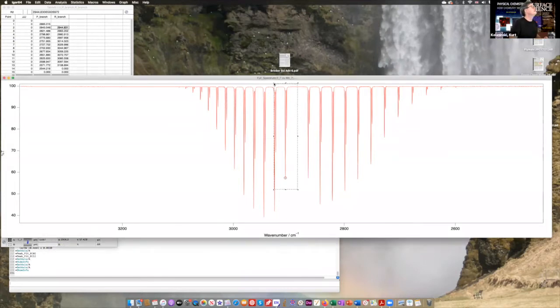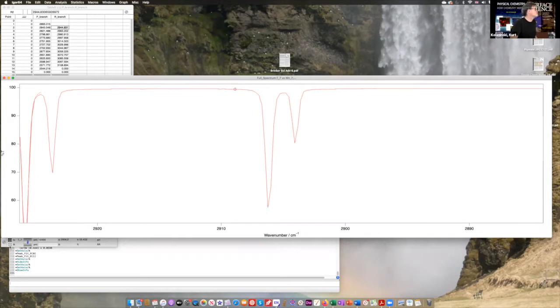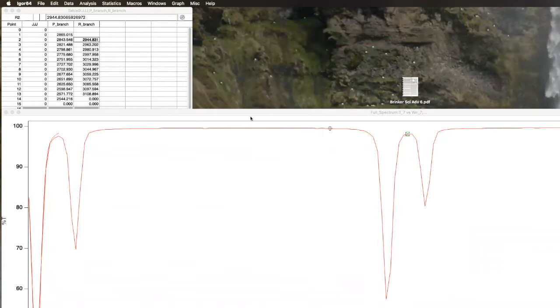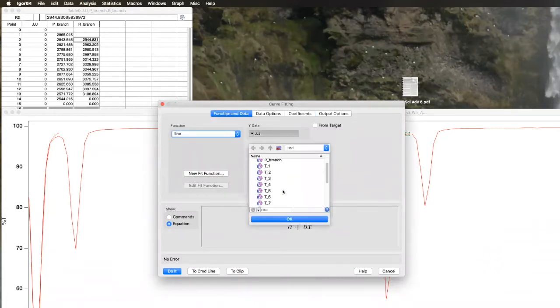We've got a nice peak here, and what we'd like to do is find out where the central position is. We took a data point — but is that actually the central position of the peak? It might not be, because there's a real line shape to this. If there's a real line shape, why don't we fit a proper line shape to it? We put one cursor on one side, one cursor on the other side — not too far, because there's a second peak there we don't want influencing the first.